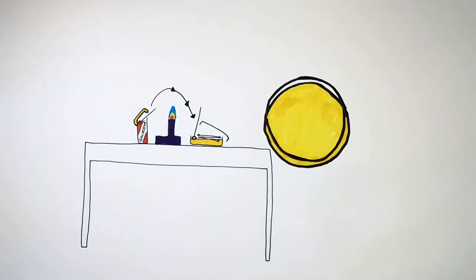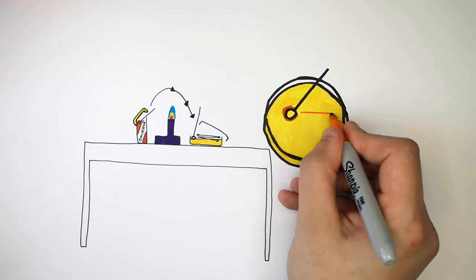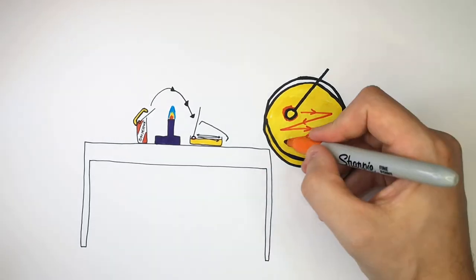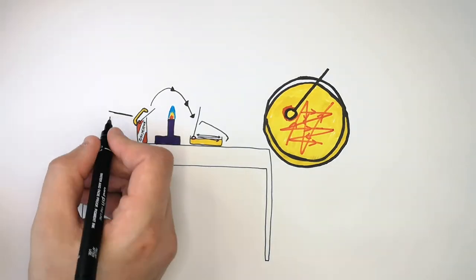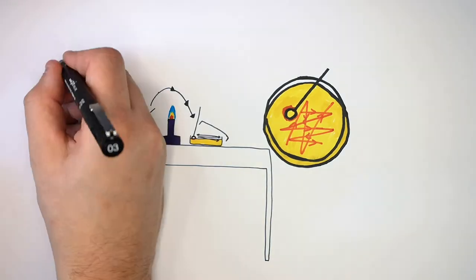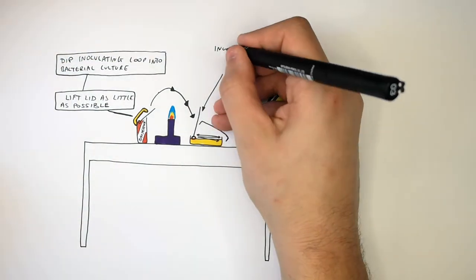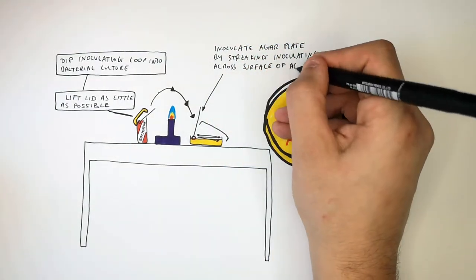Your inoculating loop should now have the bacterial culture on it. Streak your inoculating loop back and forth across the agar on the plate, going up and down and left to right. Replace the lid onto the agar plate as quickly as possible to prevent cross-contamination. Remember: lift the lid of the bacterial culture as little as possible, dip the inoculating loop into the bacterial culture, then inoculate the agar plate by streaking the loop across the surface of the agar.